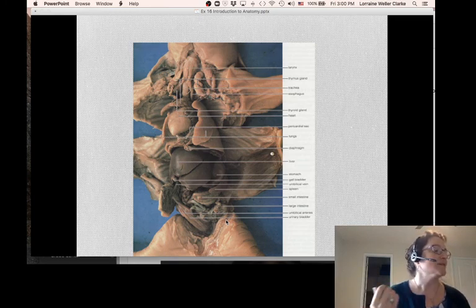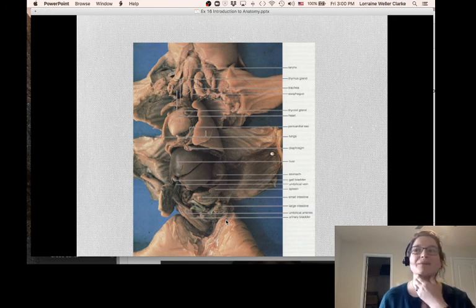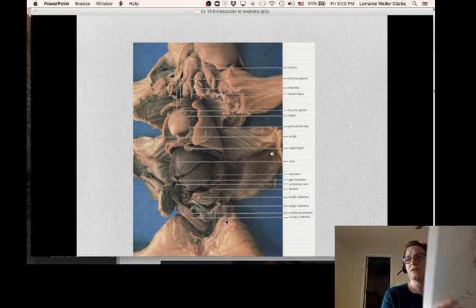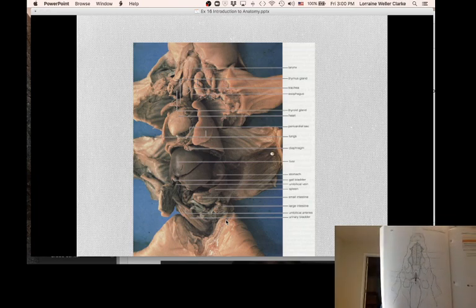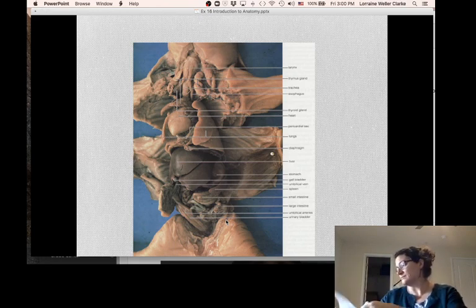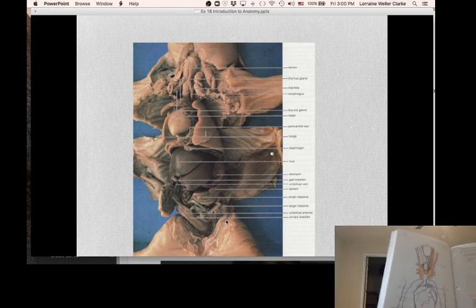Part of the digestive system is located in the thoracic cavity. We talked about the esophagus, okay? Go through those. Answer them. If you have trouble answering them, you don't know how to answer, say, the challenge question or what the vital capacity is, etc., make sure that you go through it and do label your pig, okay? Go through and make sure you understand what each of these pieces are, and pause in the actual opening of the thoracic cavity and the mouth and such. Make sure you can fill in all of these. You know what I'm pointing to here, okay? Make sure you can label all of these, okay?